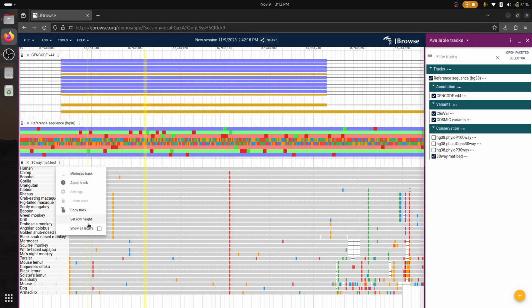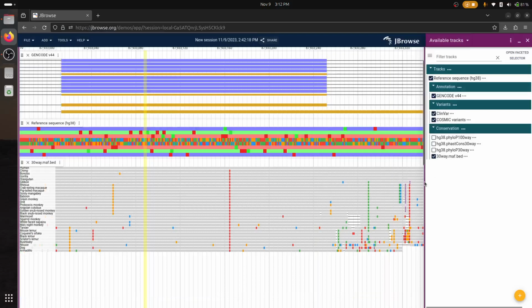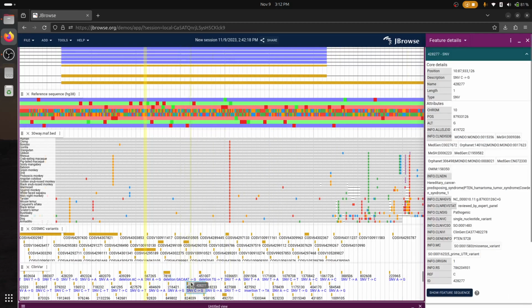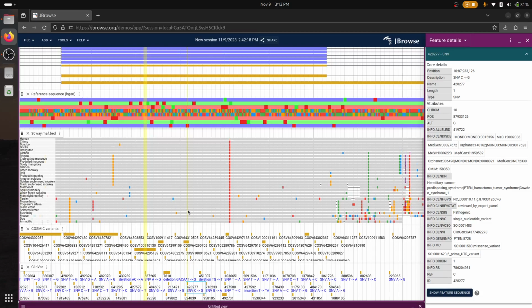And one thing I like to do is compress the data visualization down, get more dense, and you can look at any given variant and say, oh, well, there's not any variation across the tree of life there. That could be deleterious to have a mutation there.